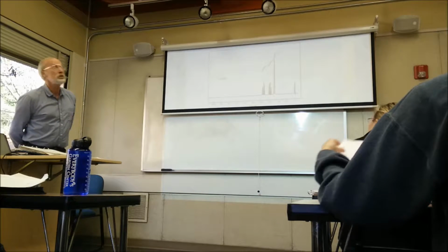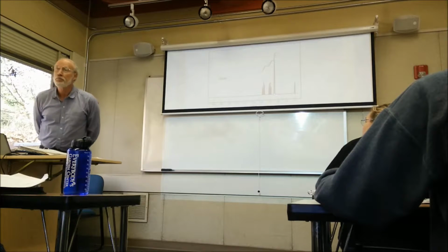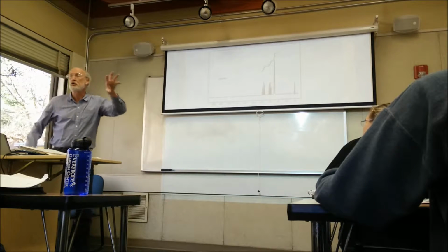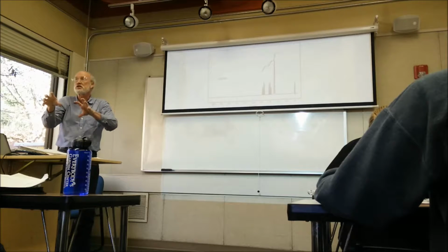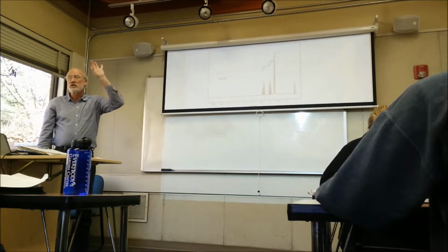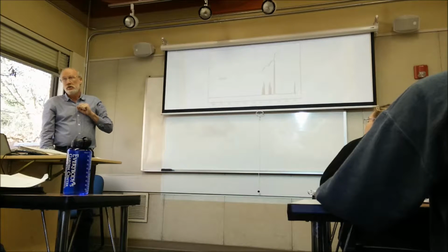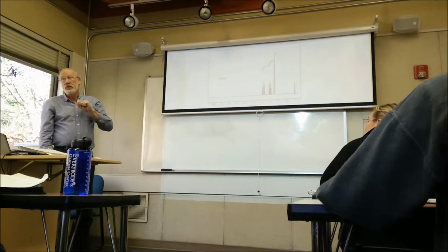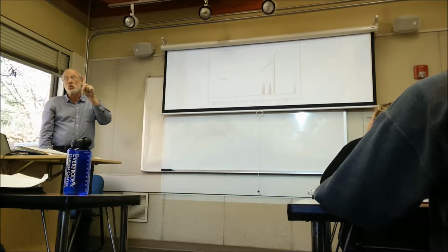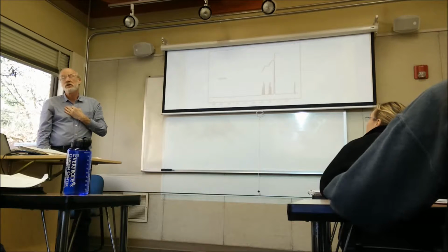Okay, and what you would do is try putting an OH group in that collection of atoms to see if you could make a molecule that would give you this spectrum. What I'll tell you is, if there's an OH group on there, I should have a peak that integrates to 1. I only have one oxygen in there, and there isn't.